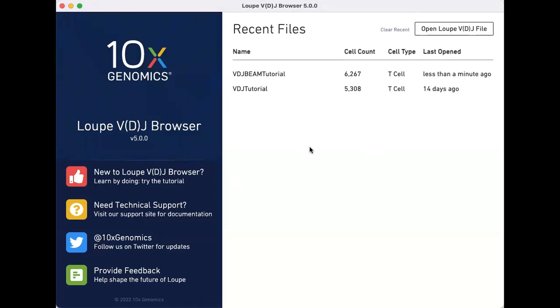In this video, we will learn how to filter clonotypes based on their association with a specific antigen. We will use the BEAM tutorial dataset that comes bundled with VDJ Browser version 5.0 and filter for clonotypes that associate with the SARS-CoV-2 antigen.